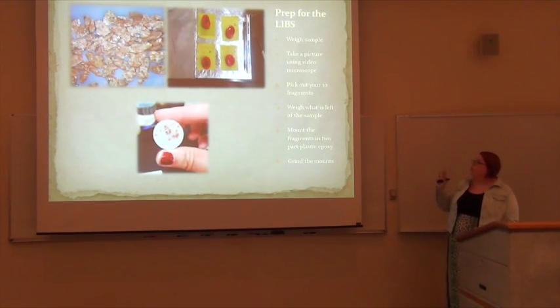So with the fragments that we are using, we mounted them with 2-part plastic epoxy. It takes about 24 hours to dry, so once they are dried and ready to go, pop them out of the little red things up here, and we ground it down to make sure the surface is flat so we can shoot the laser.